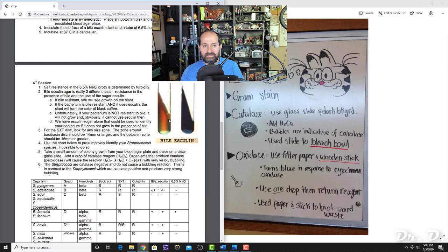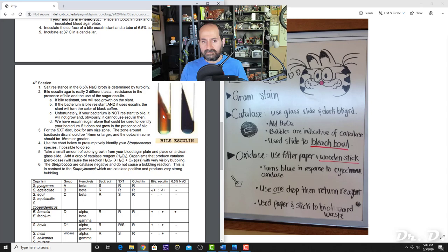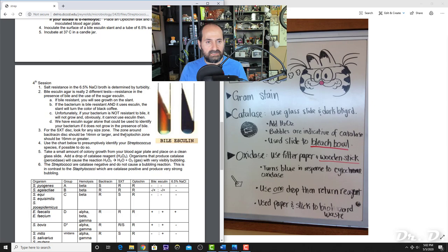The bile esculin slant is both selective and differential. It's selective because bile salts are inside the slant and only some bacteria can grow in their presence. It's differential because if the bacteria can break down the sugar esculin mixed into the slant, the slant turns almost black; if it cannot use esculin, the slant remains brown or amber.